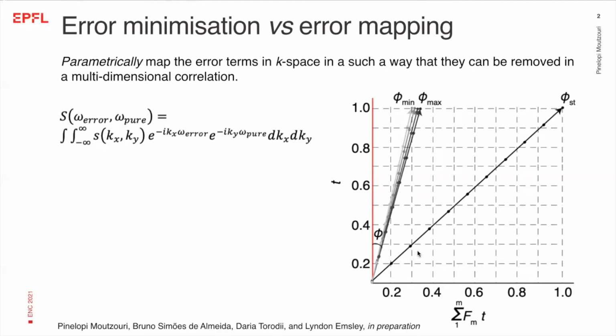In this space, any given FID will lie along a straight line at an angle phi to ky, where phi depends on how large the error terms are. As the spinning speed is increased, phi will decrease, since the error terms will progressively reduce while the isotropic term is constant. Here, we will demonstrate the method with a parametric fitting approach informed by average Hamiltonian theory.